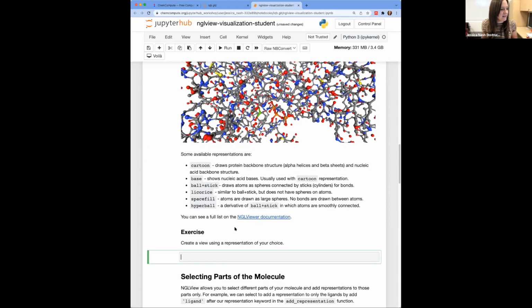And then here we have a short exercise. I just want everyone to take like 2 minutes and play around with these different representations. So let's just take a few minutes and do that.